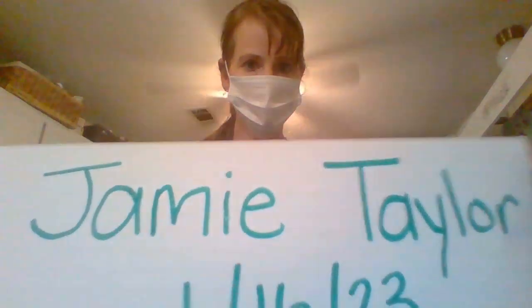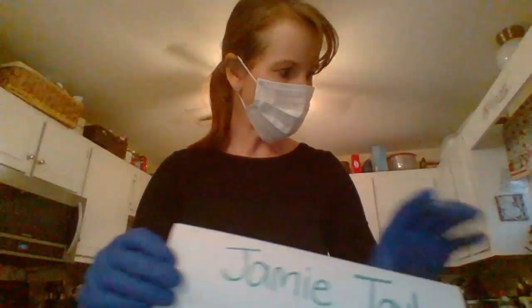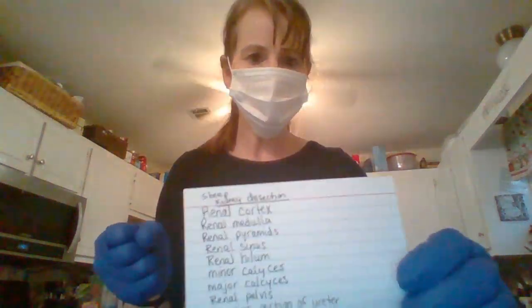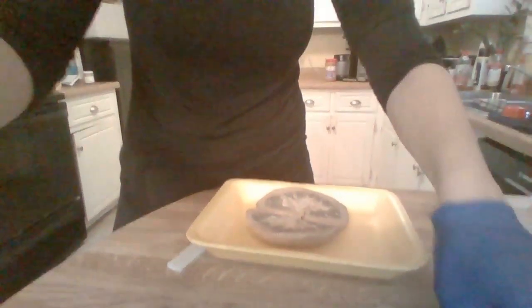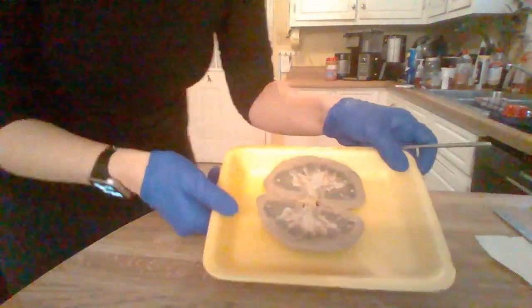Today is January 16th, 2023, and I will be going over the kidney dissection. I do have this note card I'll put beside me, so I just make sure I list the different things that are required. And then I'm going to tilt this, I think, so hopefully, yeah, I think that one might be the best.